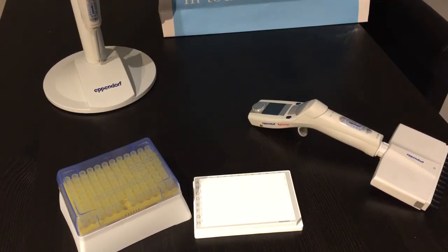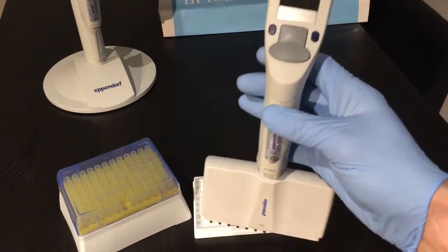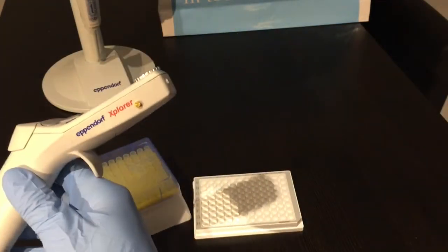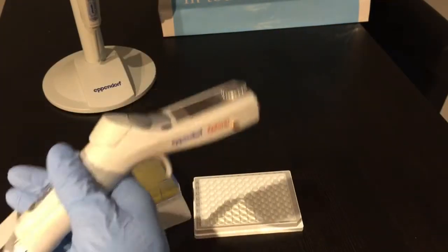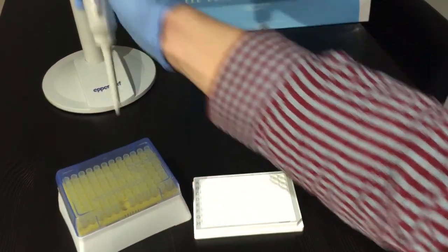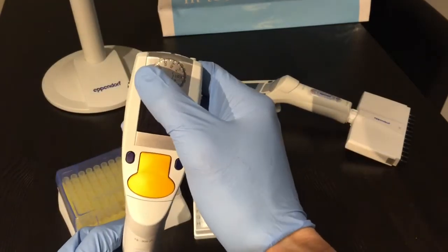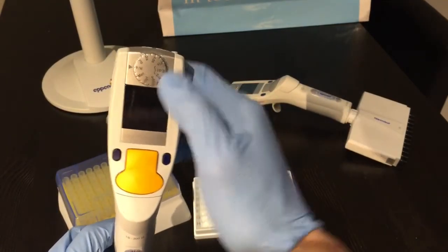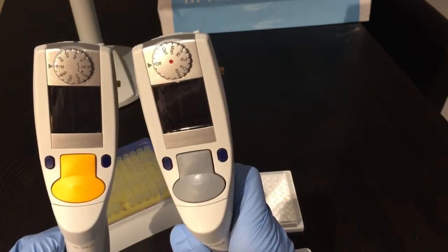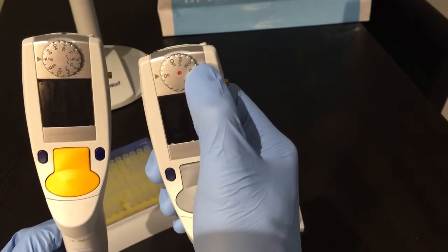Welcome to this video where I'll demonstrate the Eppendorf Explorer electronic pipettes. Today I have the 10M 12-channel Explorer version. There's also the Explorer Plus version on the charging stand over here. It has a few more features — you can tell the difference because it has more items you can select on the dial, whereas the standard Explorer has less items and is turned on by switching away from the off position.